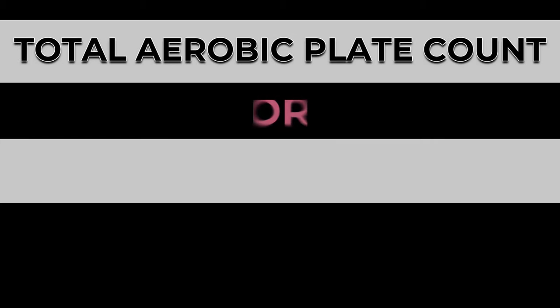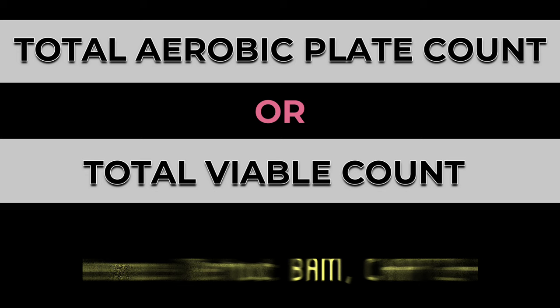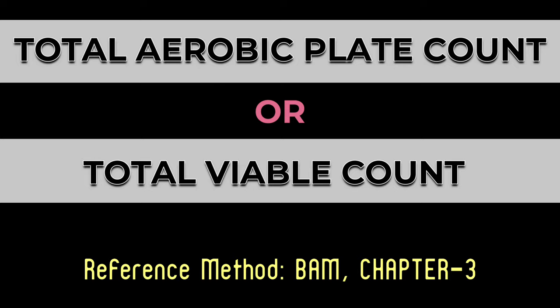Total aerobic plate count or total viable count is a very common and important test parameter which represents the microbiological quality of any sample. Dear viewers, in this video, we are going to present an appropriate test method for total aerobic plate count.